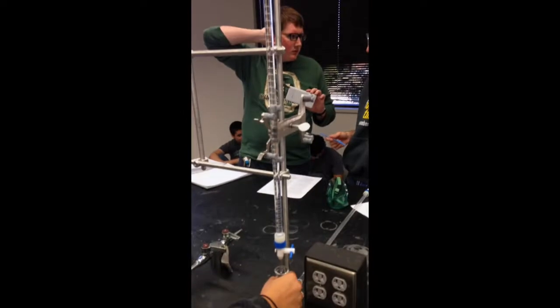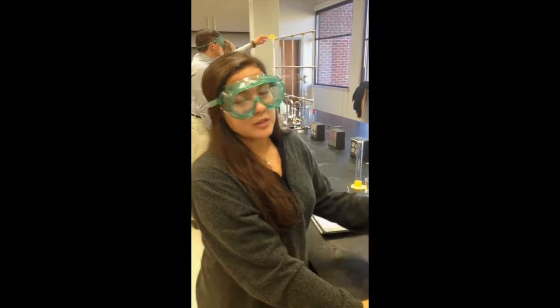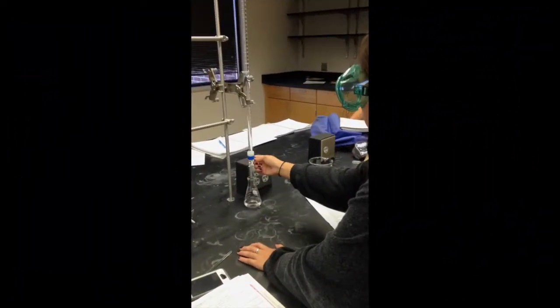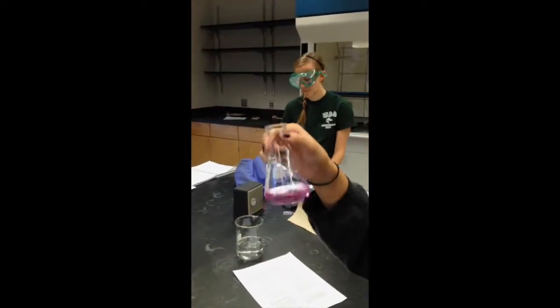You want to make sure you swirl it to make sure both of the substances are mixed. Okay, so we're getting close to the equivalence point, so we're just going to let it out slowly. As you can see by the color of the solution, we've reached our equivalence point.